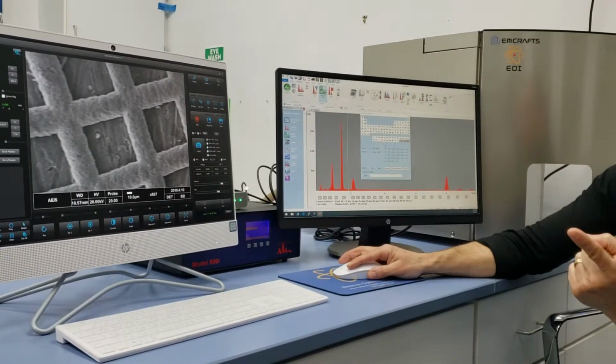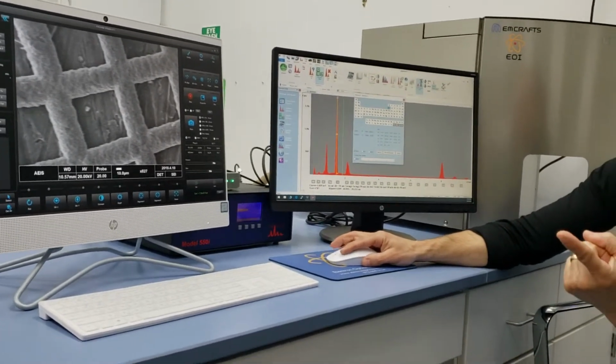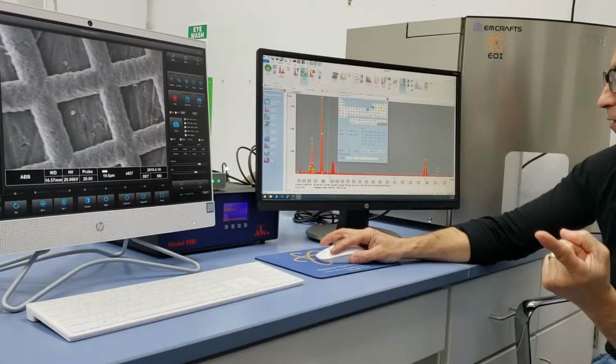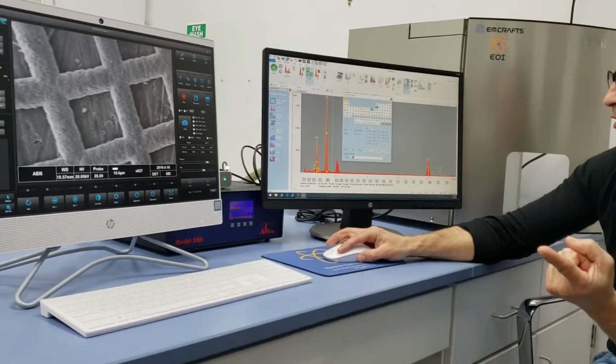And I'm just going to hit, usually I like just hit auto vertical scale, it just scales. So the first thing I did was manual label, right? I labeled it myself. The second thing I did was select a scroll peak identifier. And I slid my scroll peak identifier through the elements, and whenever I found an element I liked, I just hit add, right? That's the second way of labeling.